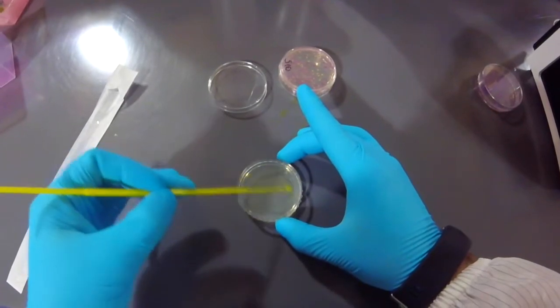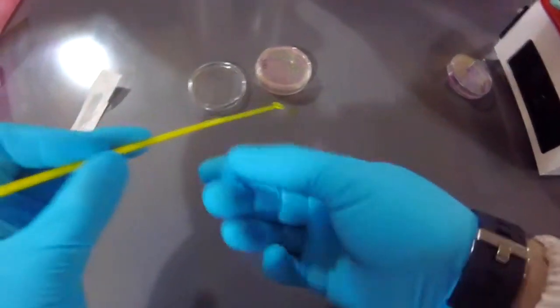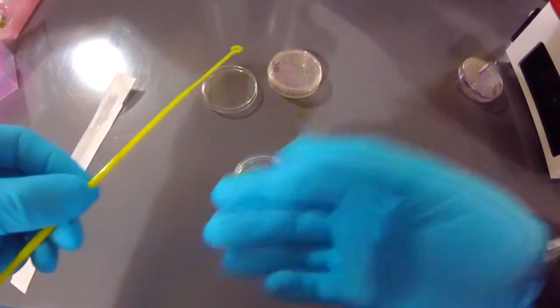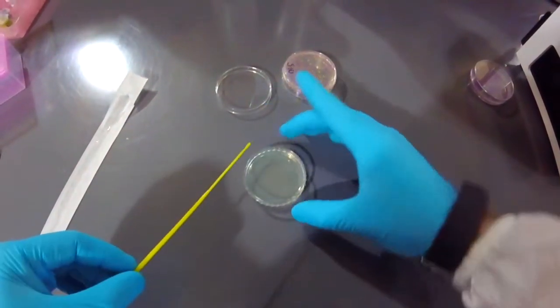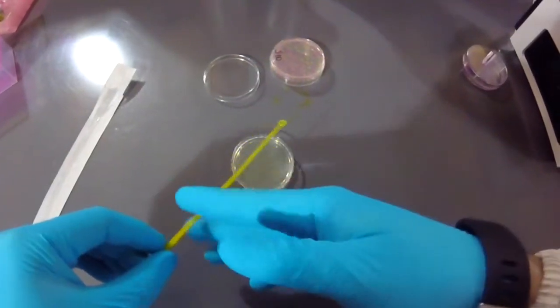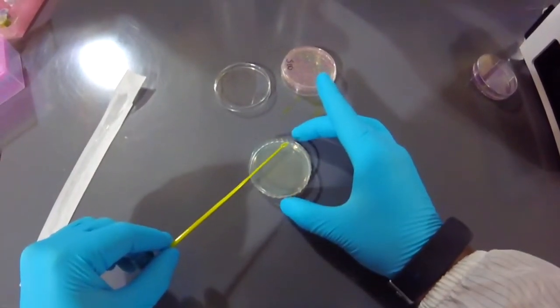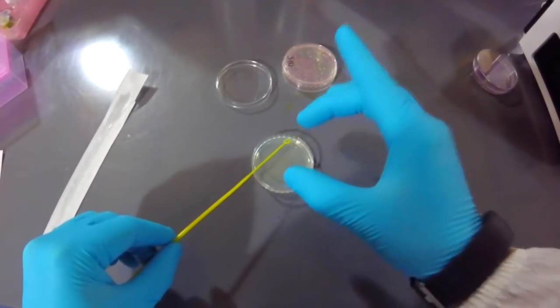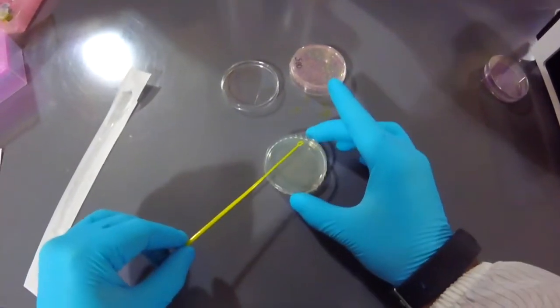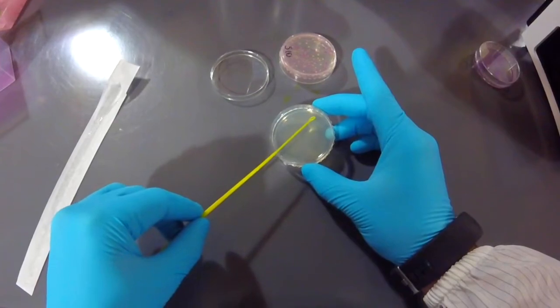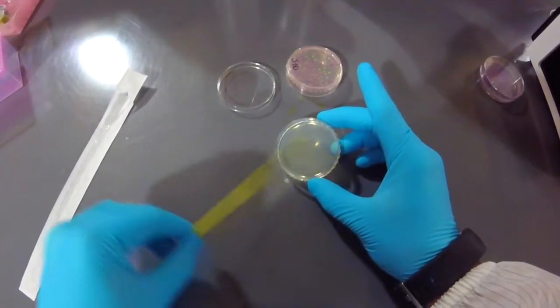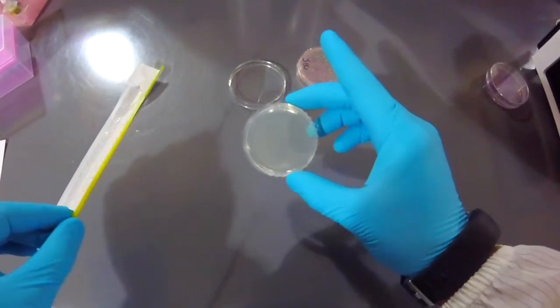All right, so now I've done my first line, and if you've done the triple streak, which you probably have, that would be the equivalent of using your first loop and then discarding it. So I'm going to turn this, and I'm going to only use this side now, and I'm going to make sure the other side does not touch, and the tip does not touch, the agar. And I'm going to do the second line by going through this first one here. So I'm going to go through, and I'm going to go a little bit smaller.